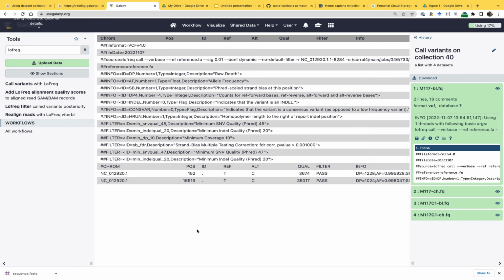So, I mean, it is a variant, but it's not a heterozygote. It's clearly a variant. It's clearly different from the reference, because the reference has a T, this has a C. So its allele frequency is essentially 1. So there's no room for... It's possible that it's a mixture, but with that percentage, it's not really. Not really.